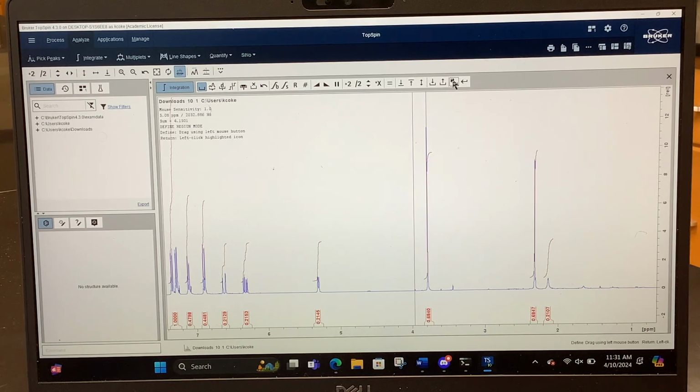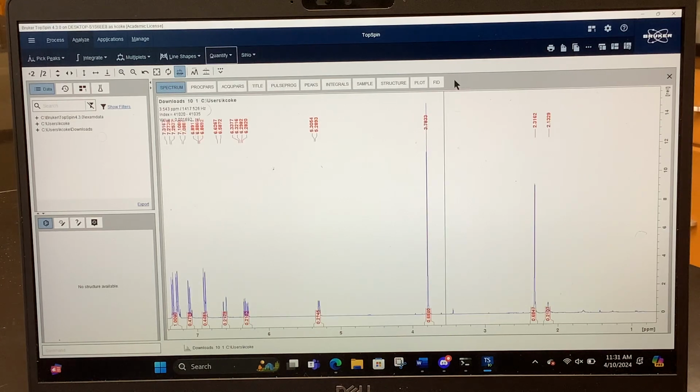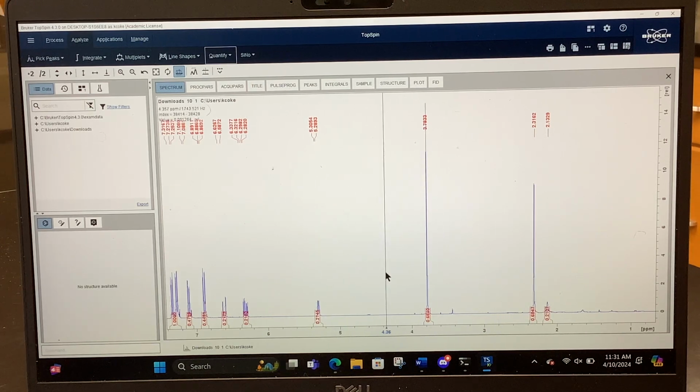And then from here, now what you're going to do, you finish with these buttons. Do not worry about any of these. You're going to press this save and return. This will, as the name implies, save and return. And it should look like this. On older versions, it may not show. It'll still be saved, it just won't show. That's okay. But you have everything labeled, so that's really all that matters here.